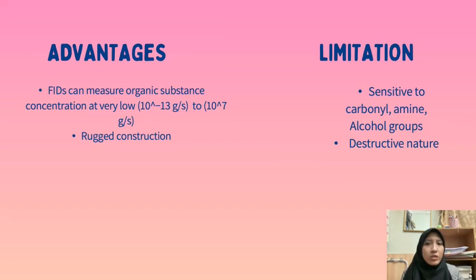Moving on to the limitations. The limitation of FID is that it is less sensitive to carbonyl, amine, and alcohol groups. The FID's destructive nature means that it cannot be directly connected to other GC detectors, which is one of its drawbacks. However, if a portion of the carrier gas stream is split between FID and another detector, a FID can still be utilized in combination with other detectors.